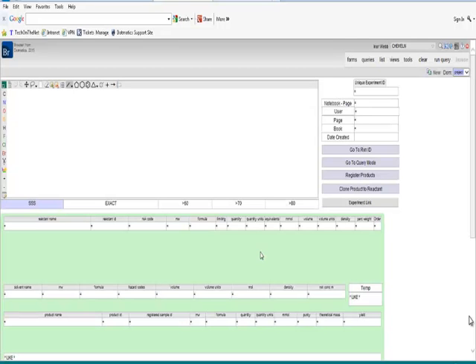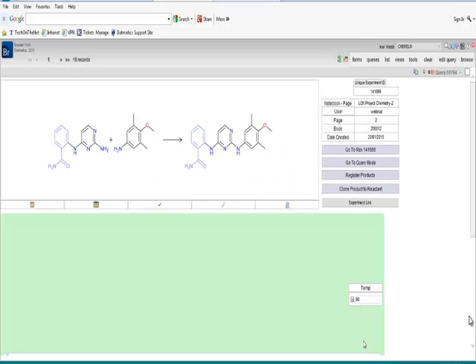And as the name suggests, it's a project, a collection of experiments from my chemistry lab notebook. And we're presented with a form and lots of empty boxes. These boxes are all tied to areas of the database, and we can enter information into any of these boxes in order to search the database. So I'm just going to search for some compounds, some reactions in my database. I'm just going to fill in a few criteria here. So I'm going to sketch something in, and maybe I'm also going to just find my best reactions, so ones with a decent chemical yield. And we'll go away, and this has retrieved 19 records.